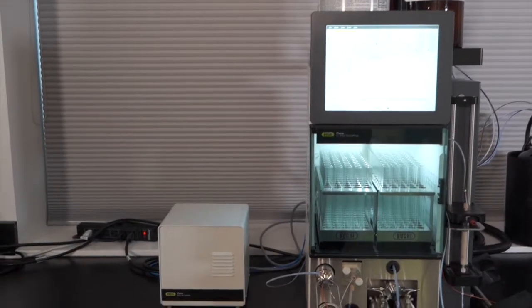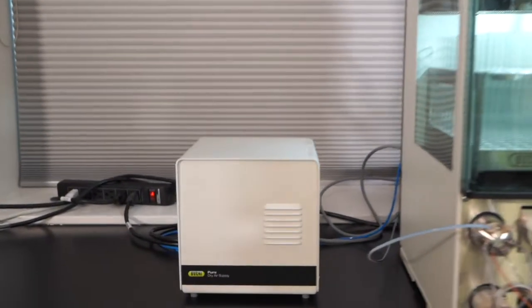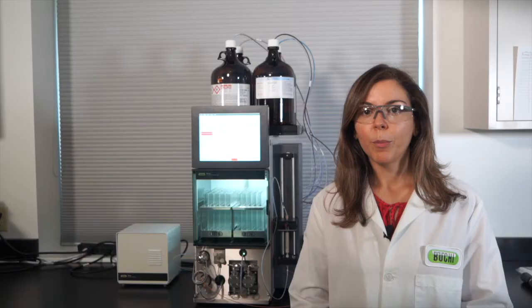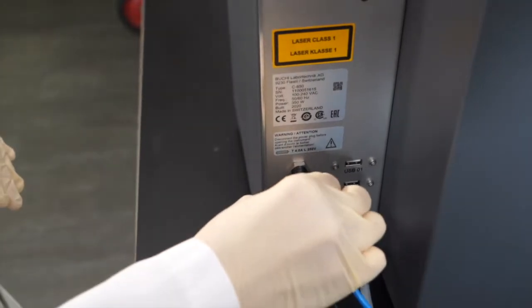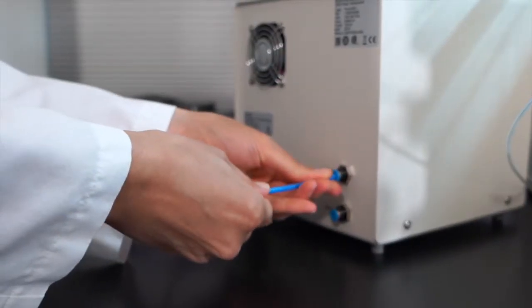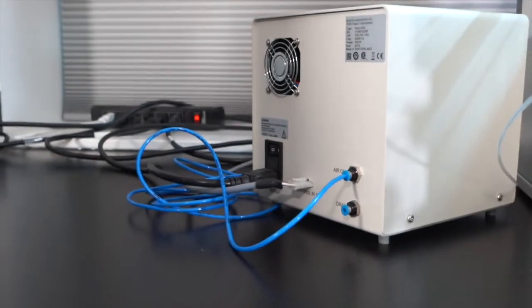Dry air is required to utilize the ELSD and atomize samples going to the nebulizer. A push lock connection for air can be found on the back of the instrument. Buchi offers a dry air supply which communicates with the Pure only pushing the air to the system as needed, eliminating the need for a nitrogen gas source. The air is also used to purge columns at the end of separation.